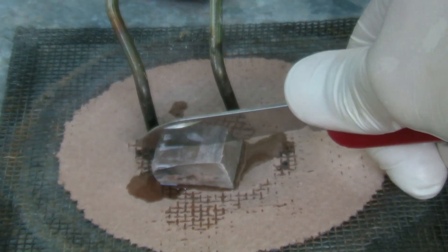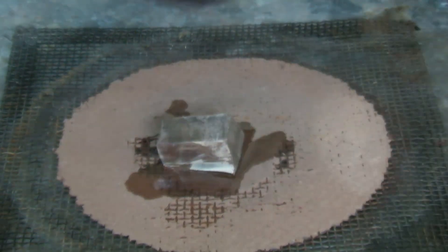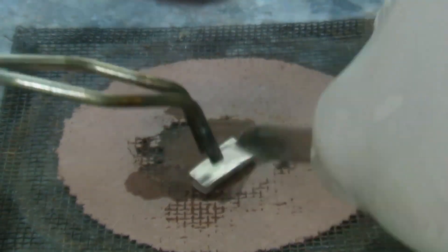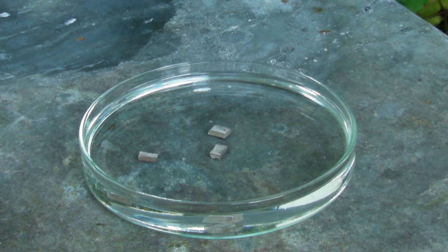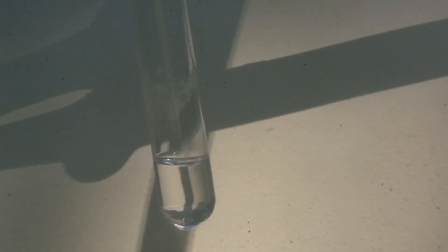The test tube is left in the cooling mixture. Then some small pieces of sodium are prepared. The other alkali metals like lithium or potassium could also be used. The ammonia is taken out of the cooling mixture and a piece of sodium is added.